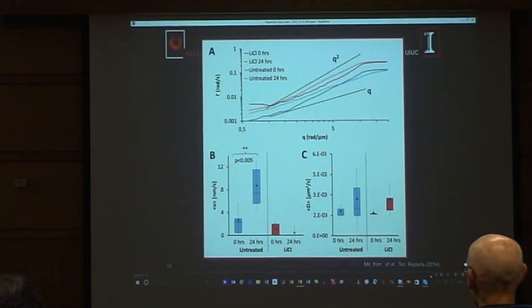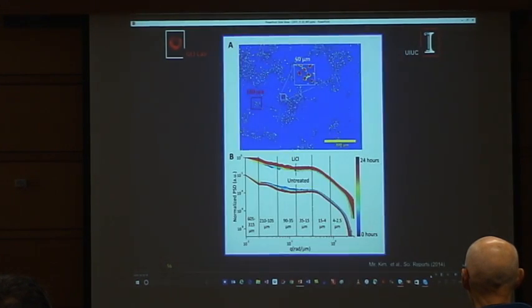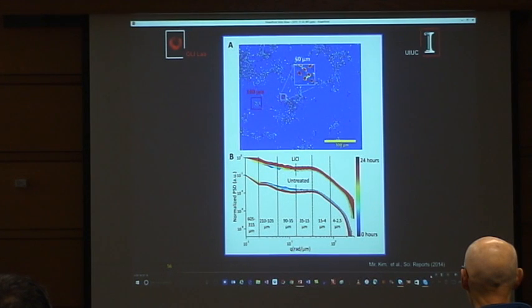So basically, when you put the cells in, they have nothing to do with one another. There's no correlated exchange of any kind. And after a while, they form those networks. They have to grow, then they form the networks, and then essentially they become organized. So that's what we can capture. Another thing you can do is look at the spatial arrangement and calculate spatial correlations, which essentially has something to do with the cluster size. So basically, from 0 to 24 hours, this is actually a power spectrum.